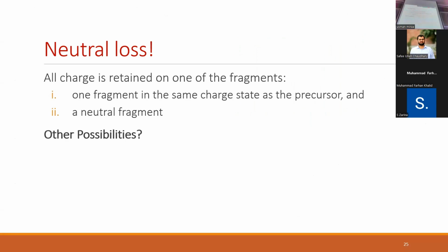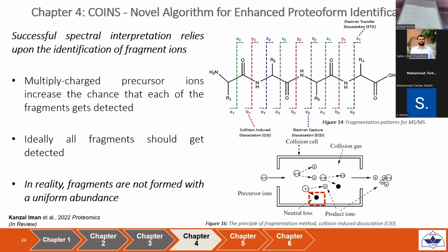And then what's the difference between the fragments in bottom-up and top-down? There also you have fragmentation. In bottom-up proteomics, we have proteolytic digestion, we have peptides. In top-down proteomics, there is no proteolytic digestion. We have fragments, and fragmentation is random. There are fragmentation techniques including collision-induced dissociation and ETD. So this fragmentation event is totally random.